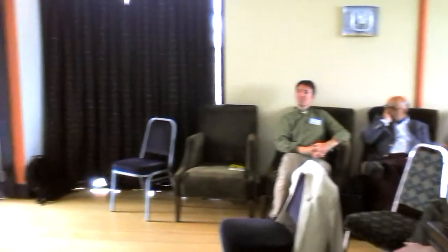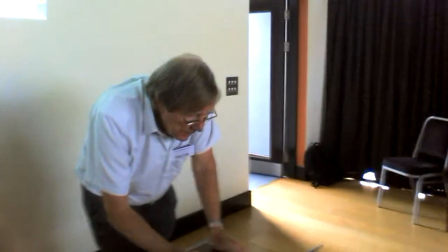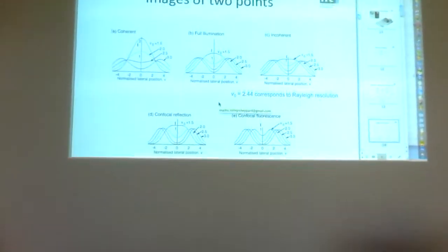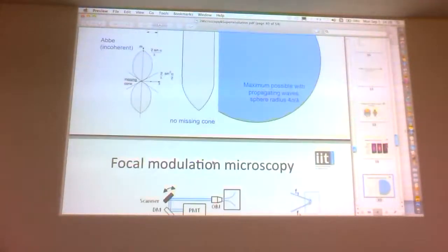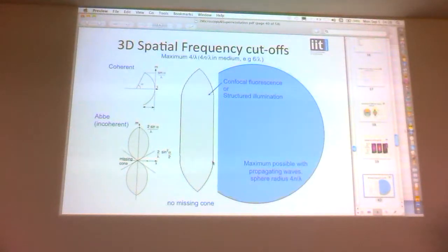Yeah? So Colin, at the end, how does Nomarski DIC stepping compare with digital holographic microscopy, which seems to be becoming quite popular? It has very poor resolution unless you do tomography. Because basically, just like in the last lecture I gave, I'll go back to that. Maybe it's worth showing that again. This one. So basically, this one shows 3D transfer functions for different microscopes.